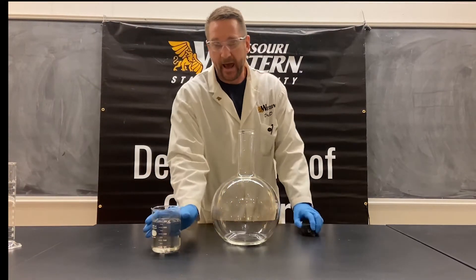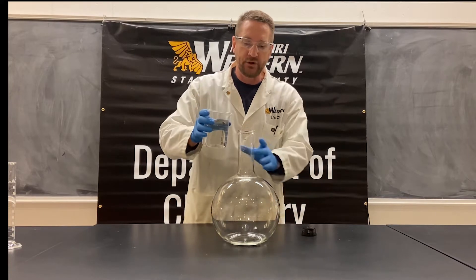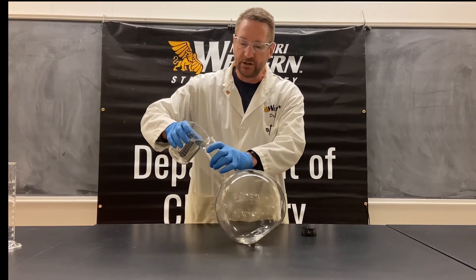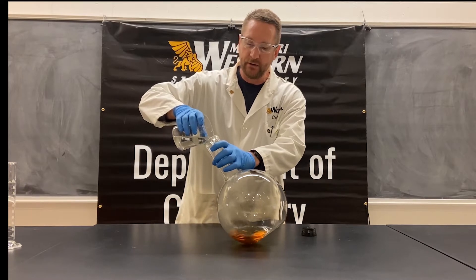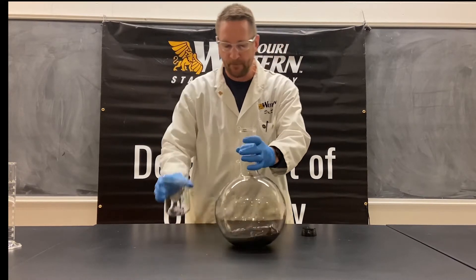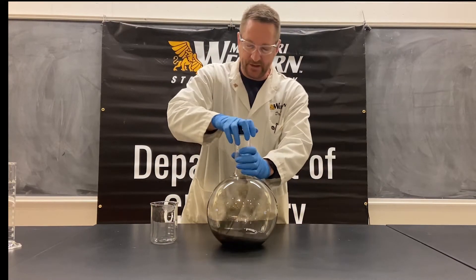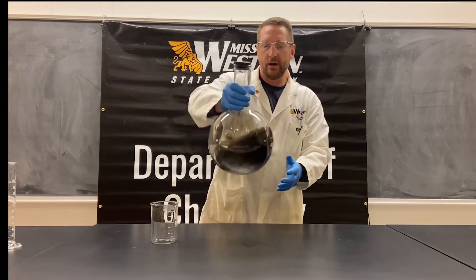Now I'm going to add a silver amine complex to this, and when we do, we are going to get a reduction of that silver onto the surface of the flask. So here we go.